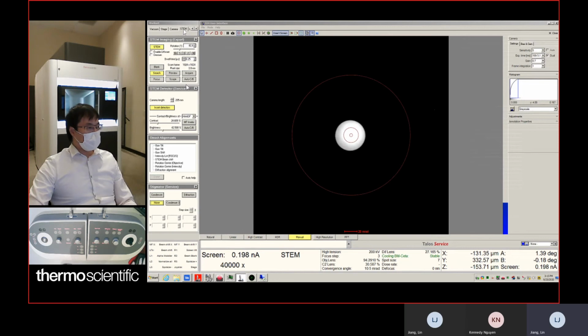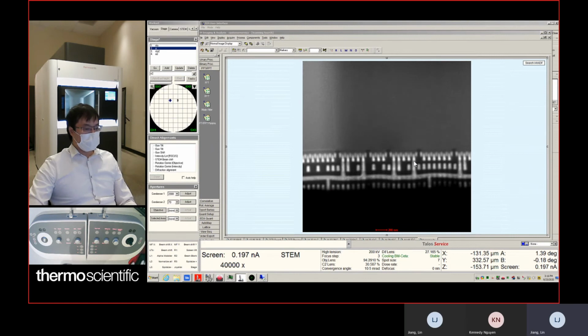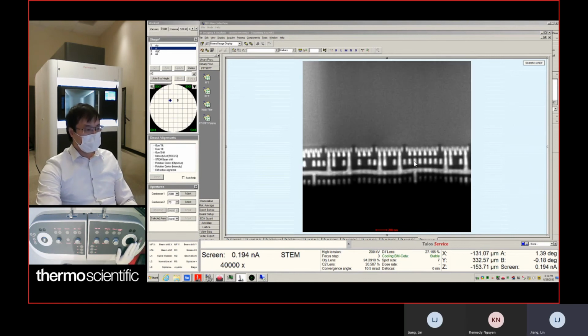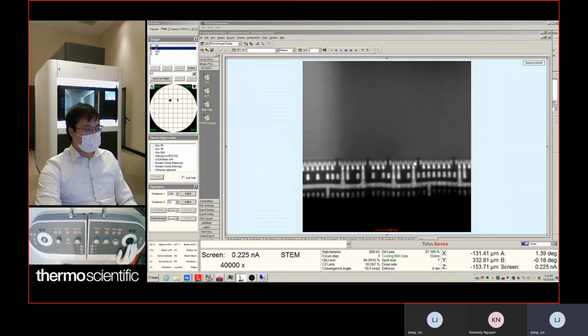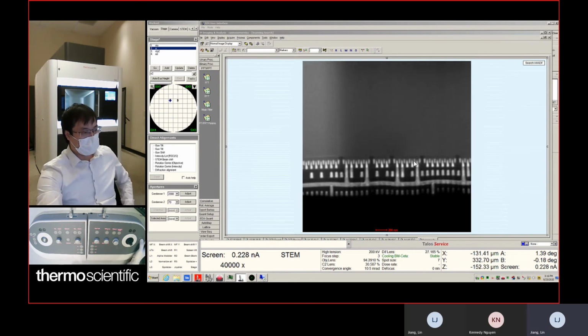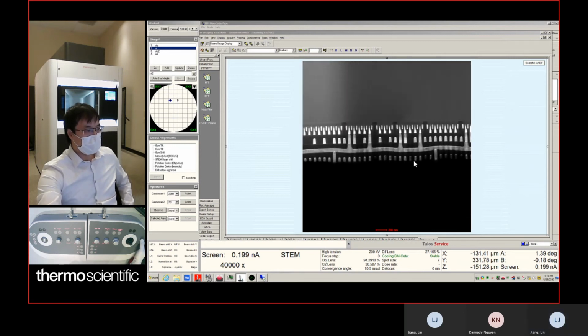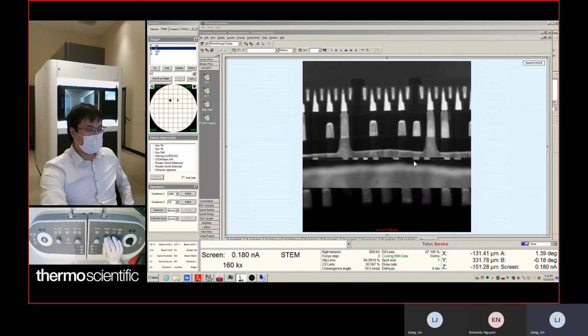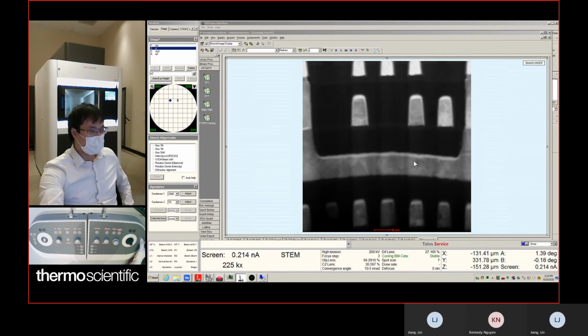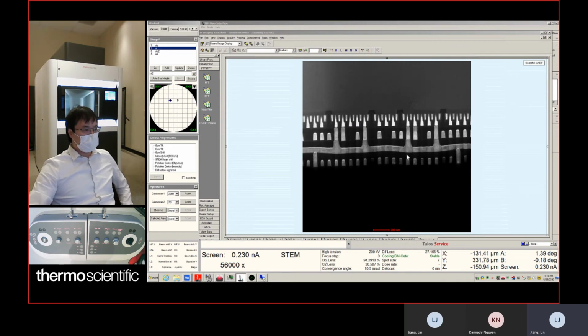And then once we're done with that, we can take a look there. You can find your sample first. We just select the image software. This is your sample. We can move. We can go stage. We can find your sample. Say this is your sample, and then we can do a little bit of focusing. Use the height. So we're close to the focus, right? Okay, then you can zoom in a little bit, do a little bit of fine focusing. So, okay, the focus is fine.